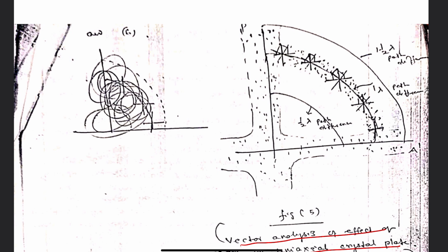So what happens to the amplitude? Let us see. Amplitude in this position will be maximum. Or here, as you see, there is destruction of light, it is a dark band. So all through the band we will get darkness, and the case is like this.